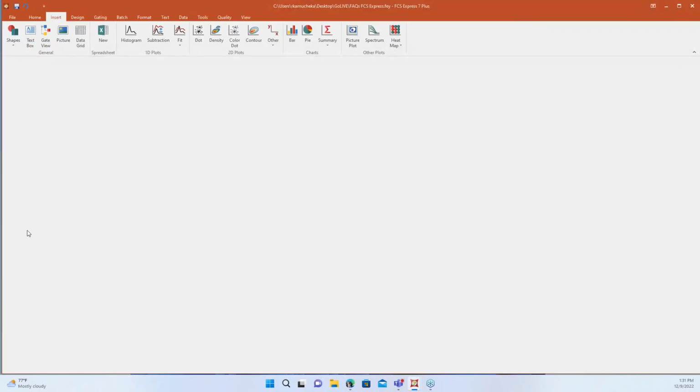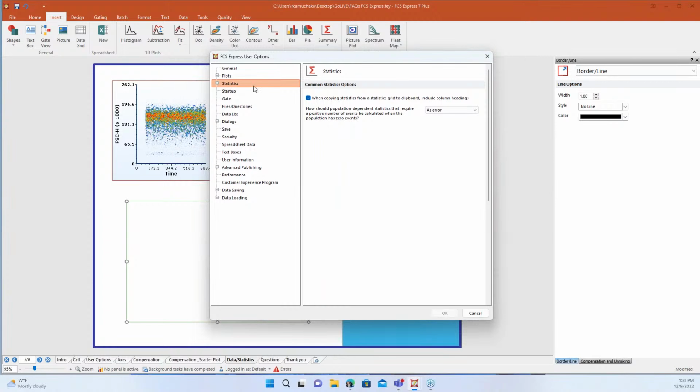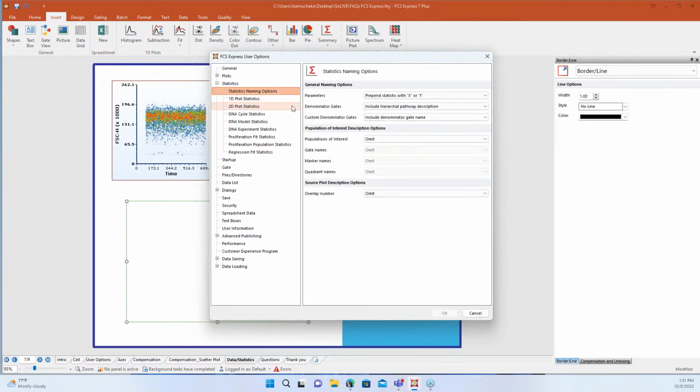So going back to those user options again, on our statistics here, if we expand this, we have some statistic naming options. This is the default, what you would see if you open this up. You can customize this. There are drop-down options, and you can specify how you want your statistics to look when you're reporting them out. So if you did see something change between your last version and now, this is likely where that change occurred. With this customization and more flexibility to get more information about those gates out into reportables, we have changed how we approached that.